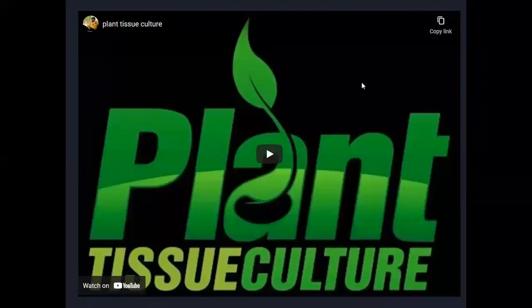This process is called totipotency. Based on totipotency, we can easily produce new plants from the explants, from the cells of the plants. Mainly, plant tissue culture is done completely in in vitro conditions.